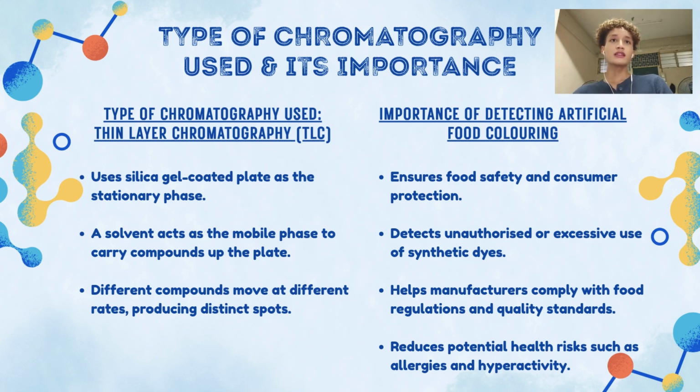In this study, thin layer chromatography or TLC was used. TLC employs a silica gel coated plate as the stationary phase, while a solvent acts as the mobile phase. As the solvent moves up the plate, different compounds travel at different rates, resulting in the formation of distinct spots.